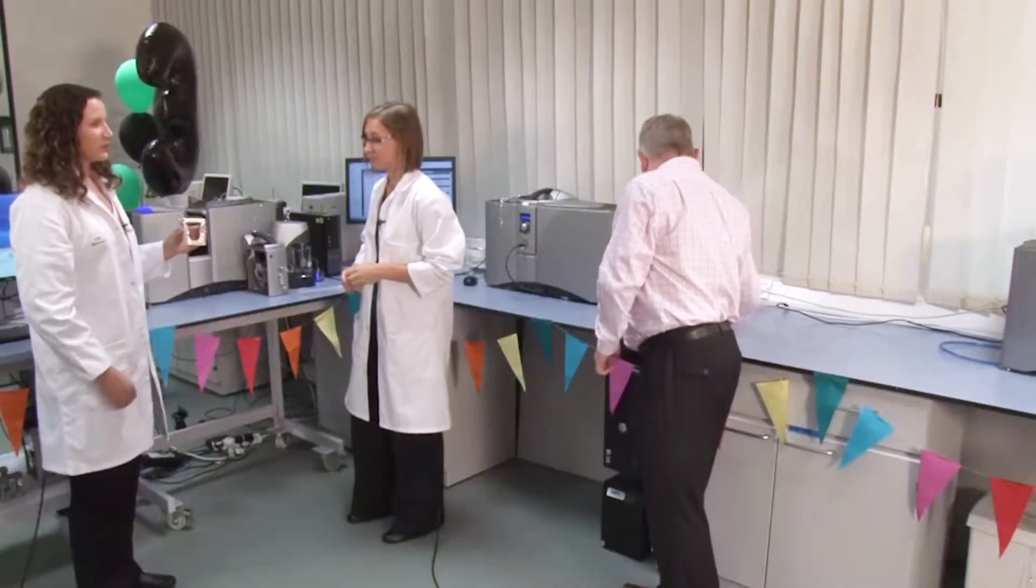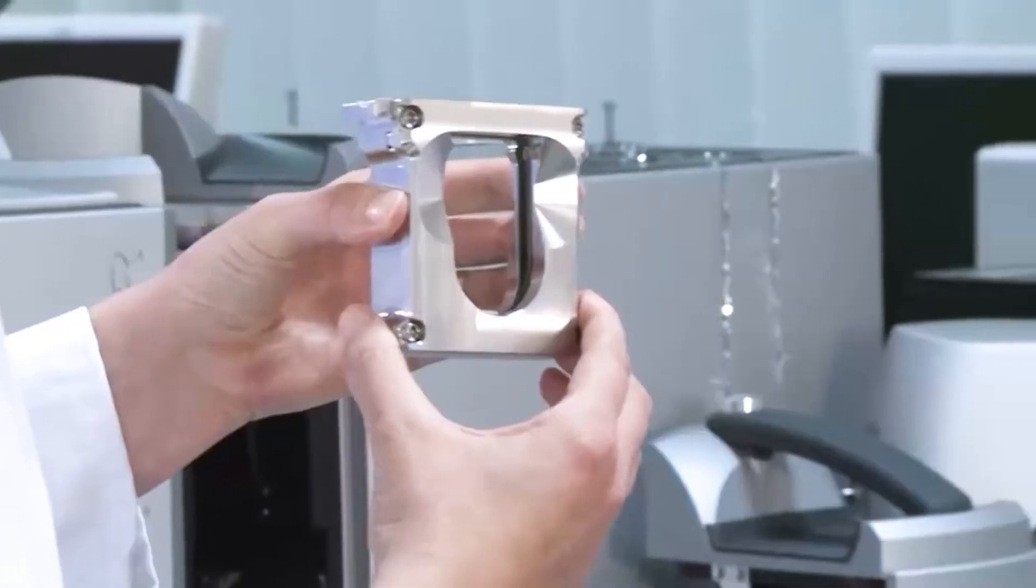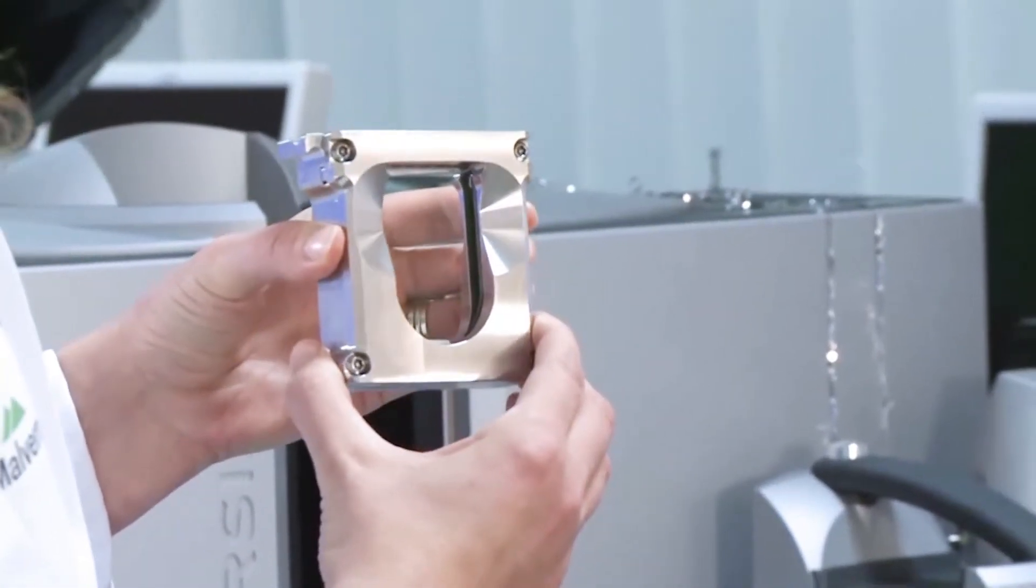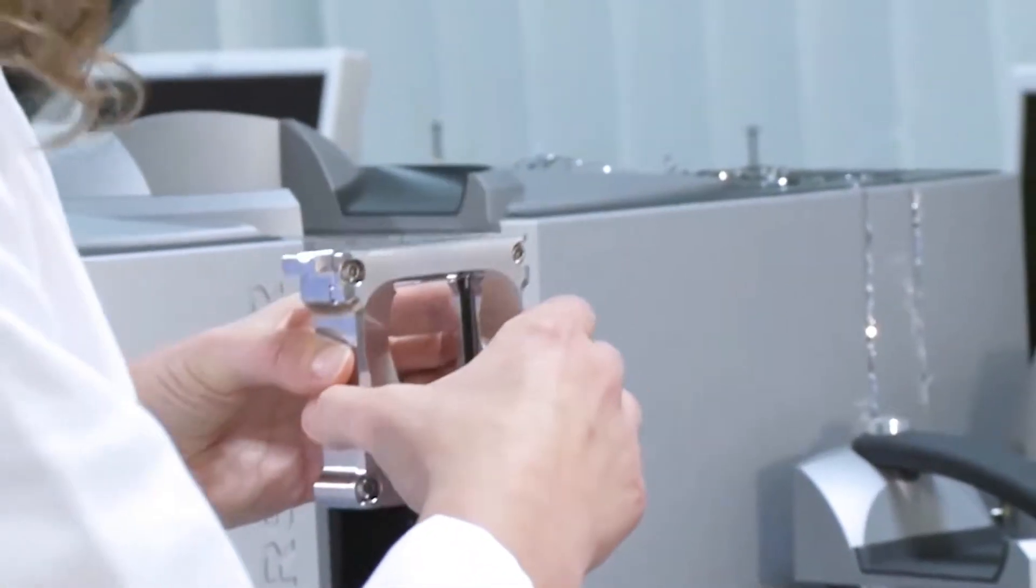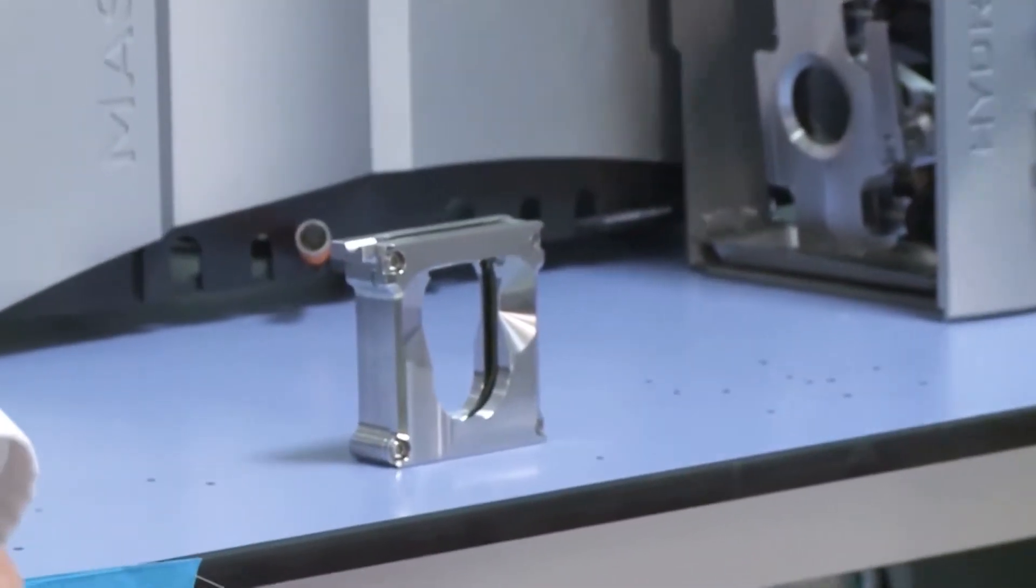Well, our development team have also been really busy working towards helping our customers at this end of the scale as well, and what we have is this new cuvette, and this allows you to measure just six or seven milliliters of dispersant, so yes, you can measure very small volumes of material. So, Anne, I'll let you show us how that works.